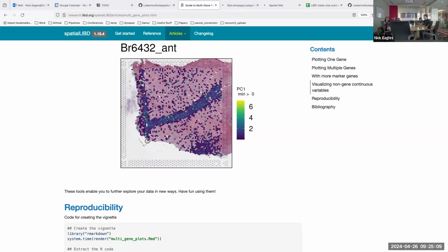So this is just using the vis_gene function from the package, but I'll also show that with this latest version, we also updated how Shiny apps that use the latest spatialLIBD work. So these features are implemented in Shiny apps. These take a while to load, and I had forgotten to load them, but in a second we'll explore a couple of them and show what that looks like.